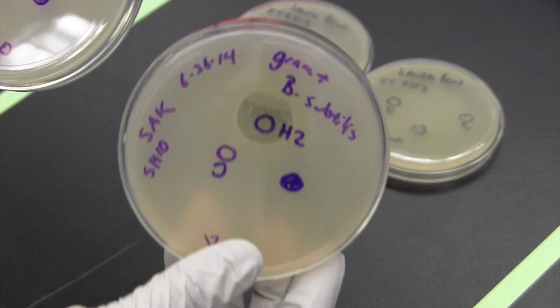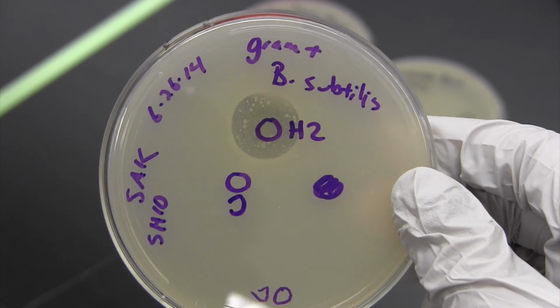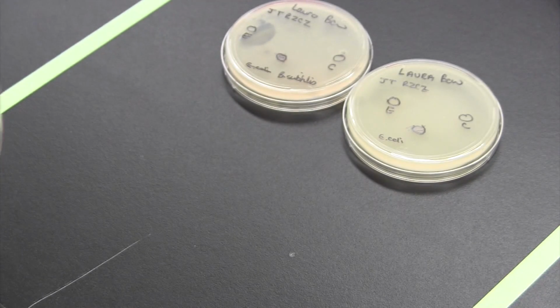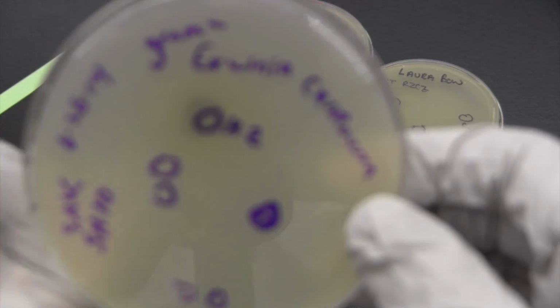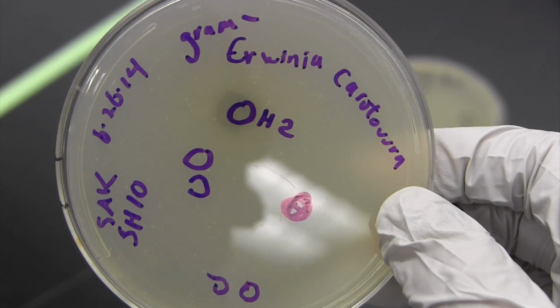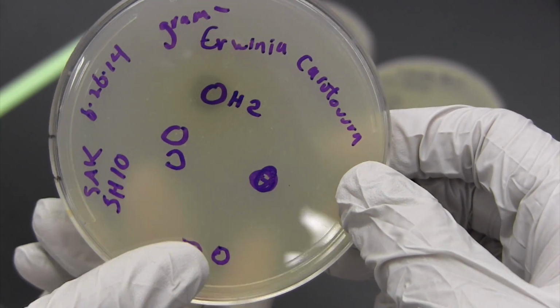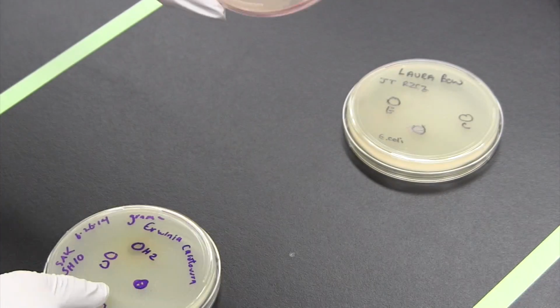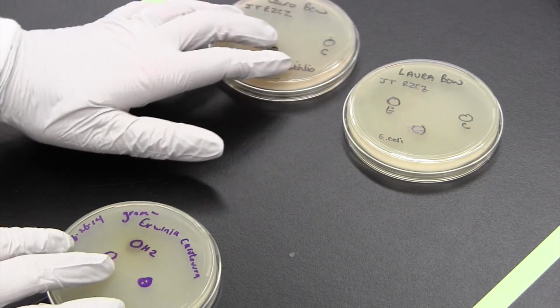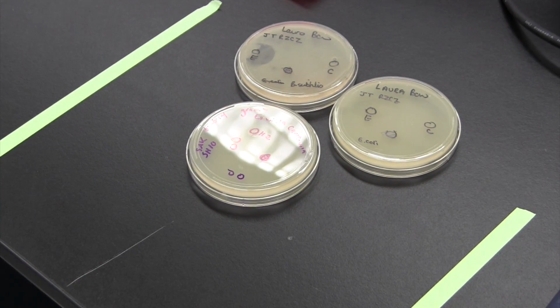Just to show you some other really nice examples of the results of a chemical extract. This is from another isolate with another student, a nice clearing here, and the control showing not as much of a clearing. This same sample against a different tester strain, a smaller clearing or zone of inhibition, and again, no effect in the control group. So you can have a range of results from no effects at all to some really visually stunning zones. This is a great opportunity to talk to your students about why you're seeing what you're seeing, and bringing forward their thinking processes.